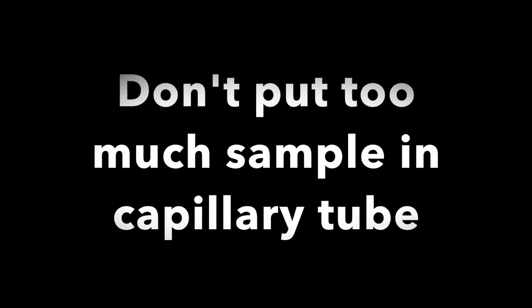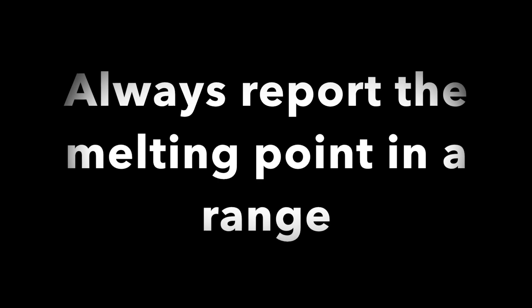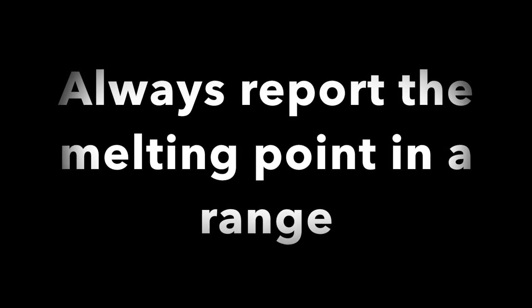Always write down values as soon as melting begins and as soon as melting ends so you don't forget them. Don't put too much sample in the capillary tube. The larger sample size will take longer to melt. Make sure the melt temp apparatus has cooled down from the previous user. Don't turn the ramp speed up too high or you won't be able to tell the temperature of the melting and your range will be wrong.